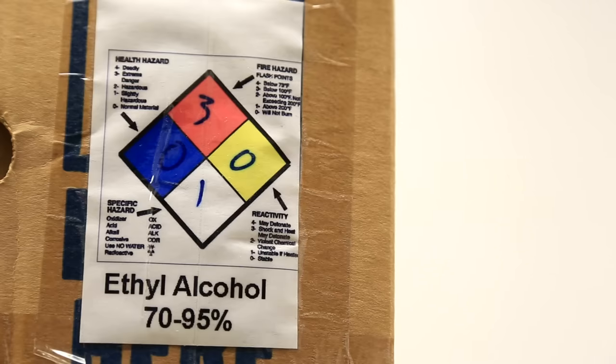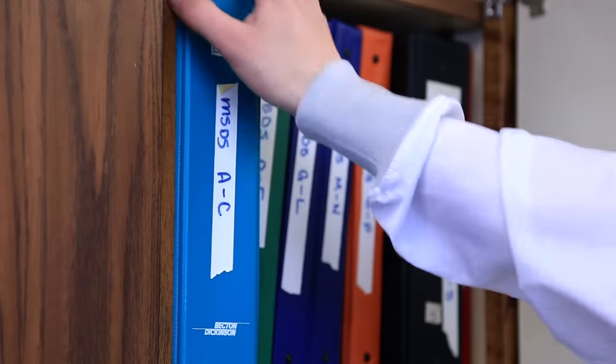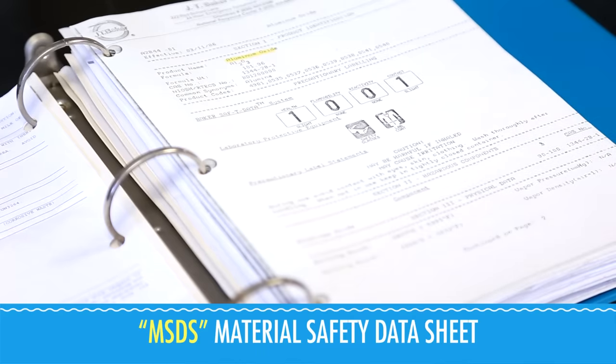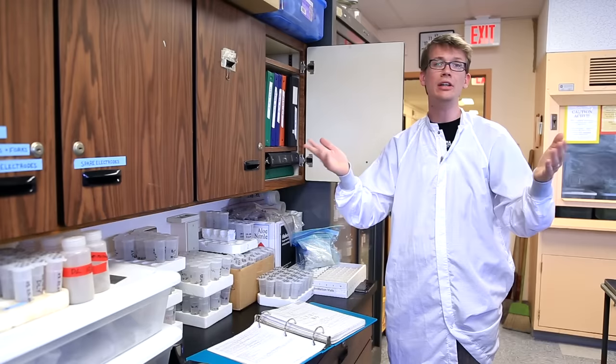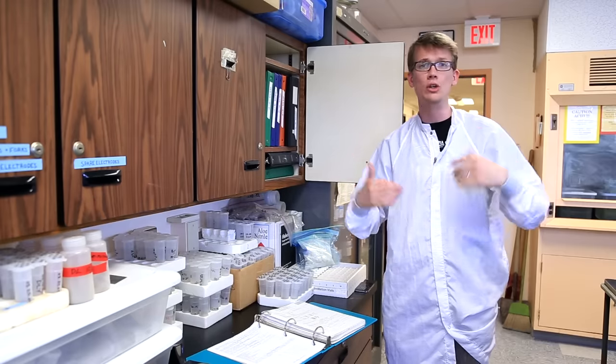And a four in reactivity means that it is capable of exploding at room temperature. The little area underneath is for any extra information, like if it's radioactive or reacts violently with water or something. If you ever need to know more about a chemical and what it might do to you or to the world, there's the good ol' MSDS, the Material Safety Data Sheet. Every chemical has one, and it'll tell you all the terrible things that it might do to you.